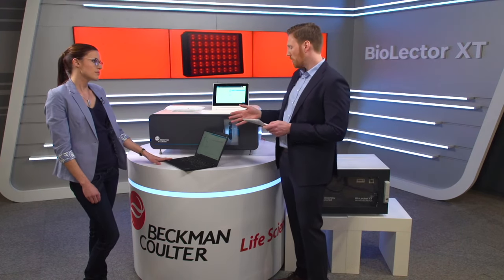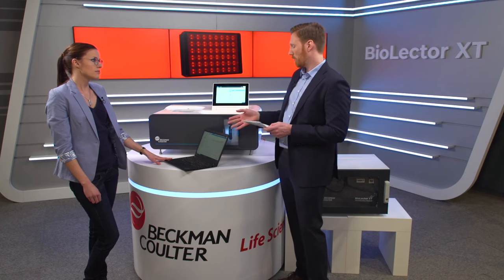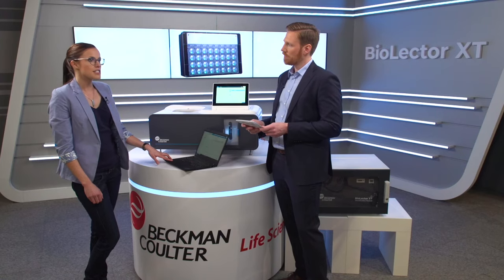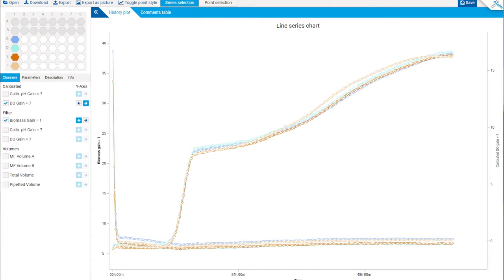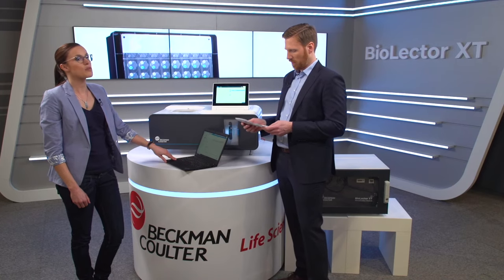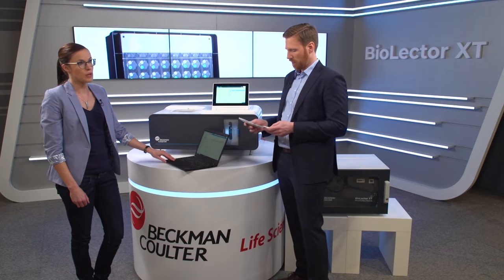I see, but you are also using a separate laptop — what do you use it for? The BioLector software is installed on this laptop. Besides using it for the creation of the experiment protocol, you can view the measured data from the BioLector microbioreactor online directly after it has been recorded. Here you can see, for example, the increase in biomass and the decrease of oxygen of the culture. With the BioLector software, you can directly see the development of the cultivations in each single well. This can be monitored from your lab or remotely, for example when you have to work from home office.